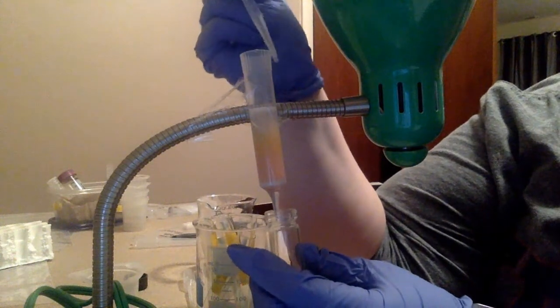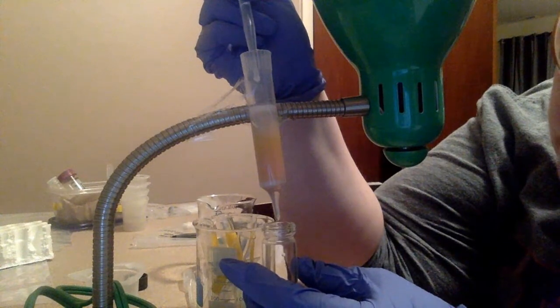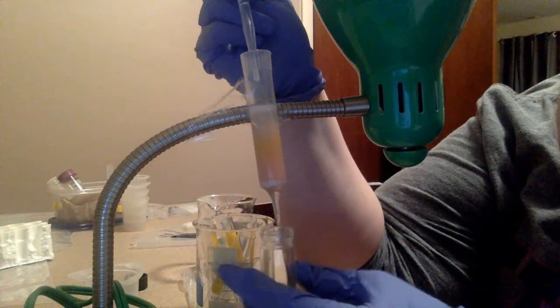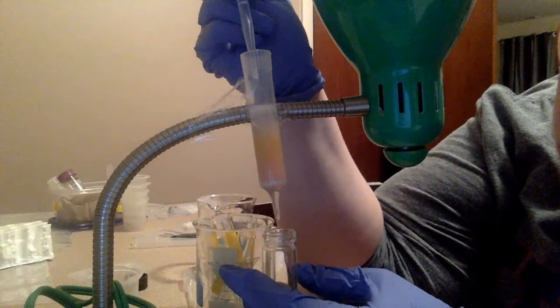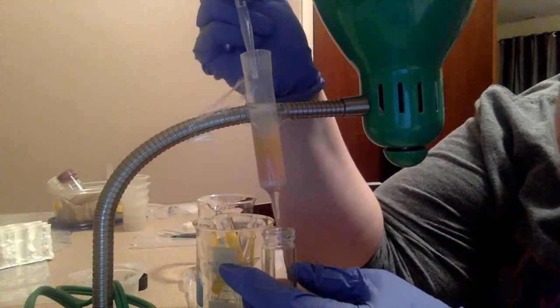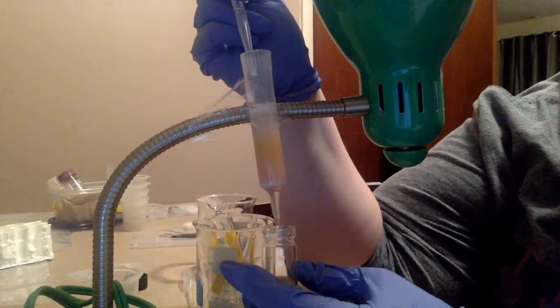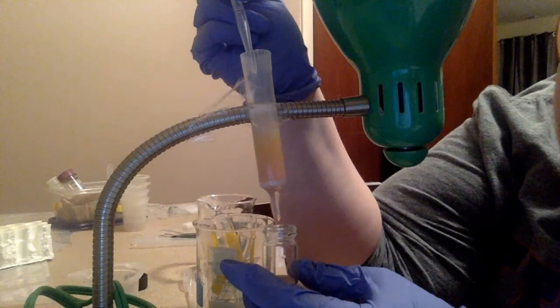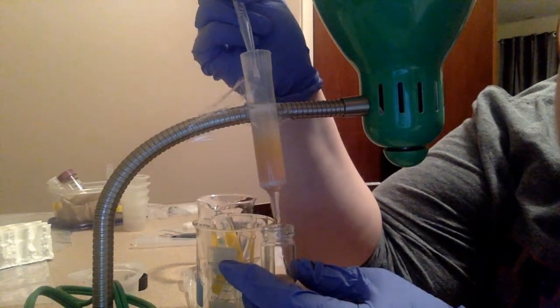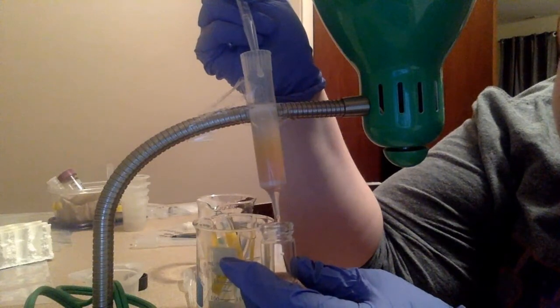So I'm going to keep adding here. I'm collecting here. My drips are pinkish in nature now. And again, I want to do my best to collect these separately, so I'm adding drop per drop at the top. I know it's hard to see, but I'm only adding one drop at a time in the top. That way I'm carefully controlling what's coming out at the bottom.